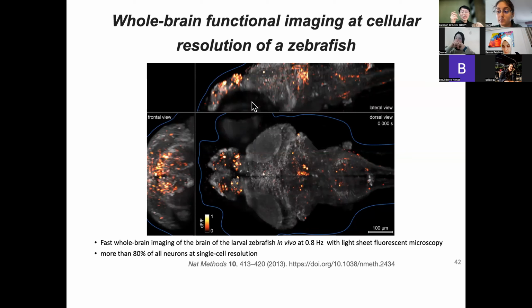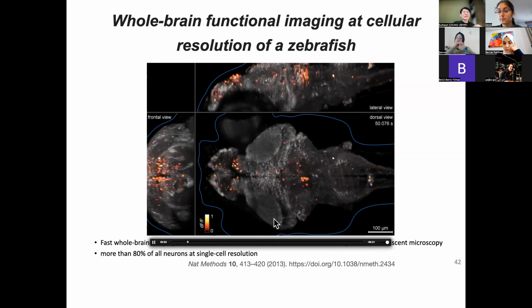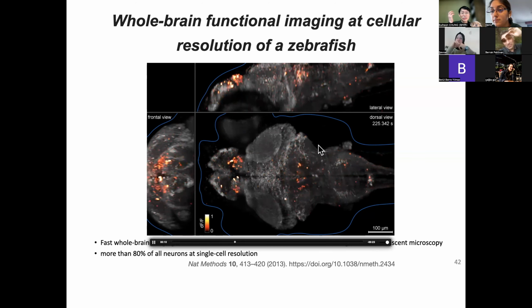Our dream is to understand how every single neuron inside the brain generates signals and communicates, so that it allows us to understand our emotions and our memory and our daily thinking, what's happening in our brain. We cannot do this in humans first. The zebrafish is a little transparent. So here's an example of a 3D real-time view of a blinking spot. This is calcium imaging at single cell resolution.